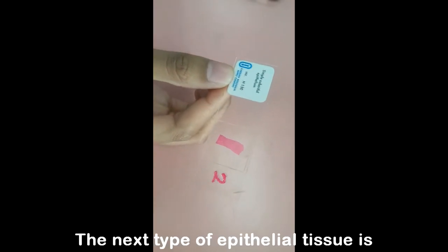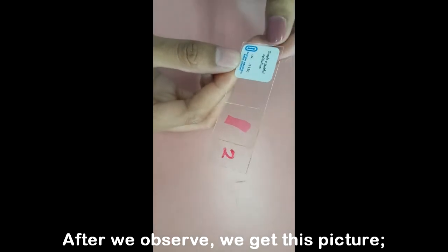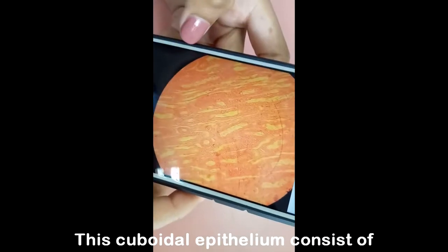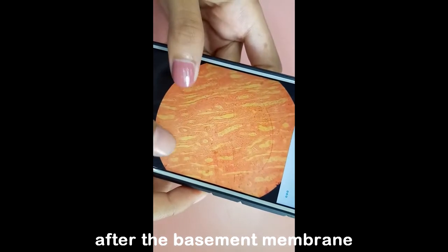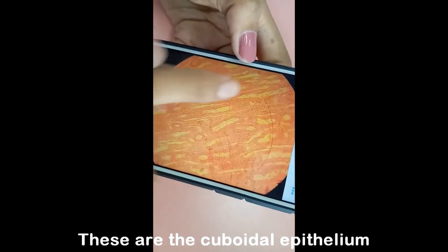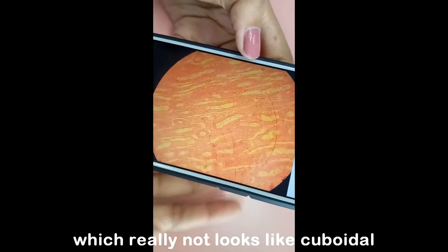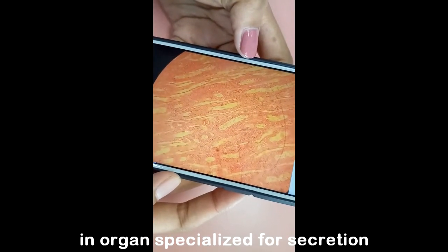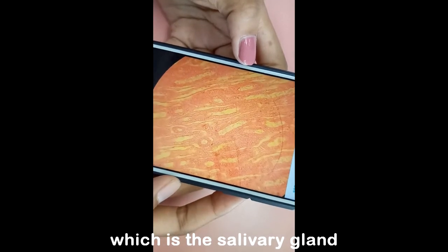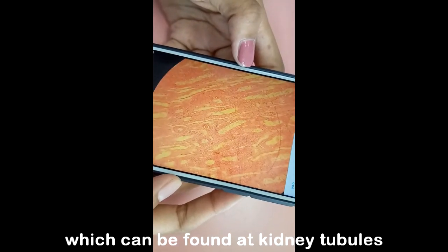Okay, the next type of epithelial tissue is the simple cuboidal epithelium. After we observe, we get this picture. This cuboidal epithelium consists of a single layer of cuboidal cells on the basement membrane. These are the cuboidal epithelium, which do not really look cuboidal, but this is it. It can be found in organs specialized for secretion, such as salivary glands, and its function is for diffusion, which can be found in kidney tubules.